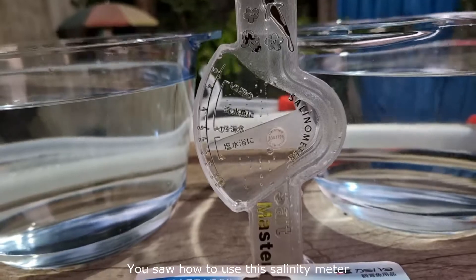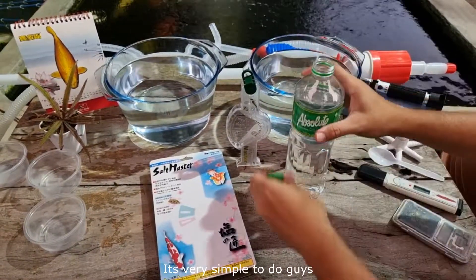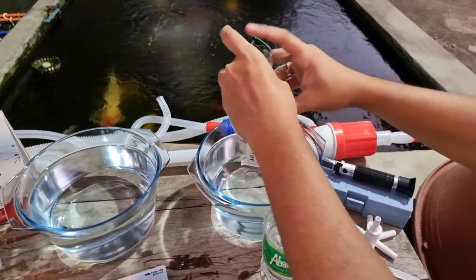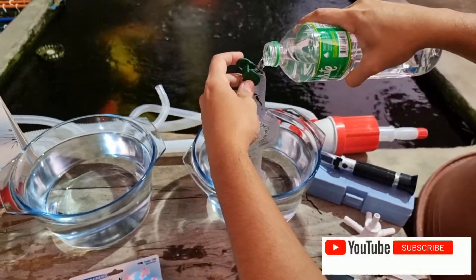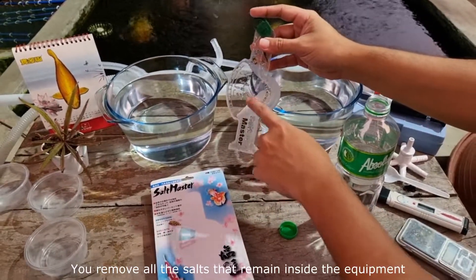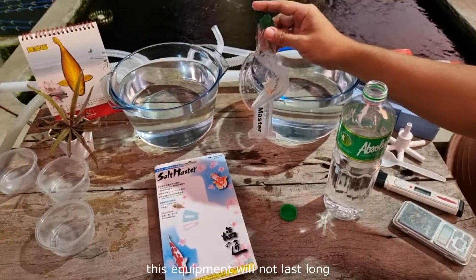So there you saw how to use this salinity meter from Salt Master. Once you finish using it, you have to rinse the equipment properly — I recommend using distilled water. Flush it out, and do it a couple of times to be sure. When you rinse it, you remove all the salts remaining inside, which keeps the equipment clean and makes it last longer. Do not neglect this rinsing step — it's very important. If you skip it, this equipment will not last long.